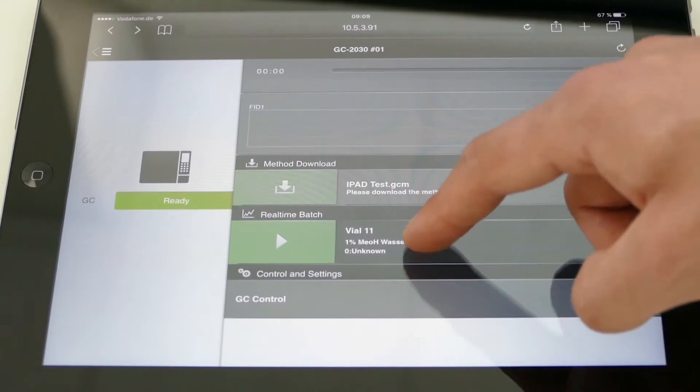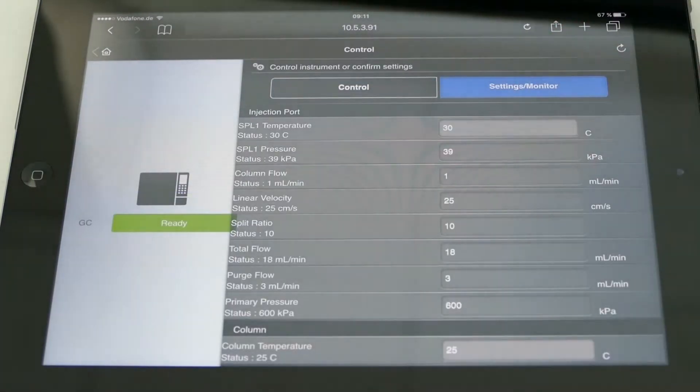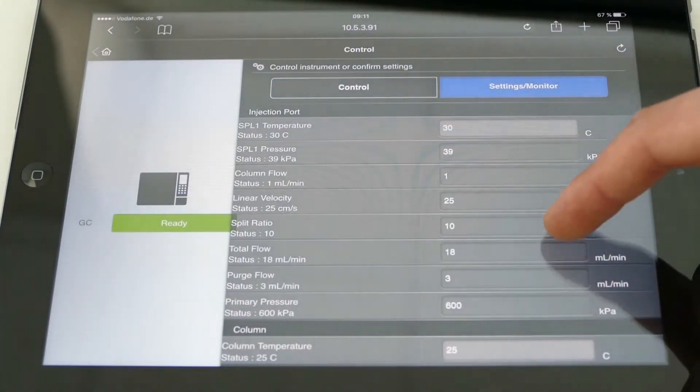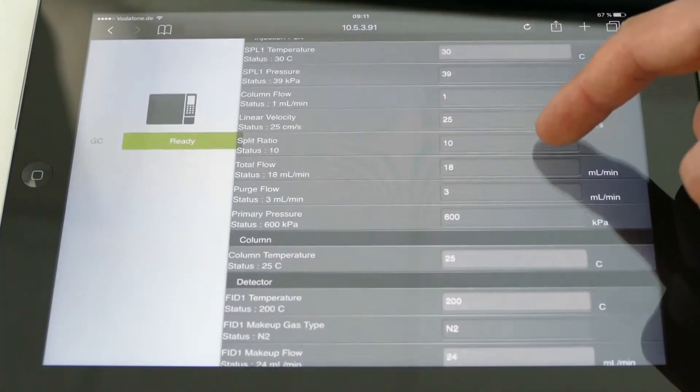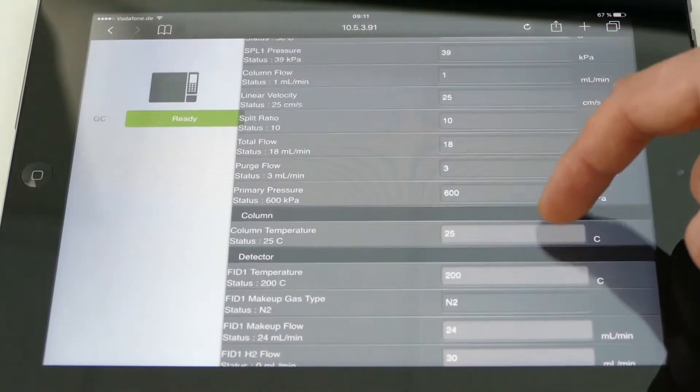Having instant access to your Nexus GC2030 systems helps save valuable time, allowing you to focus on other tasks.